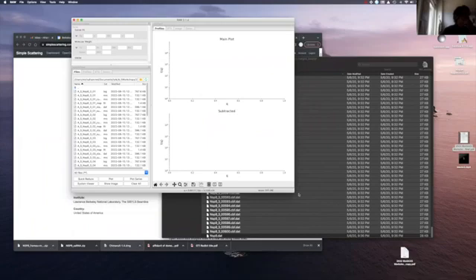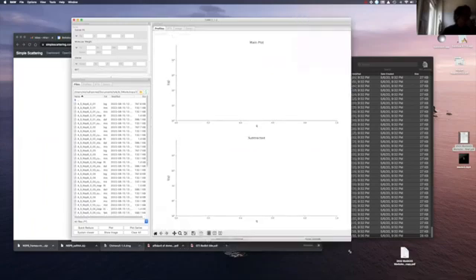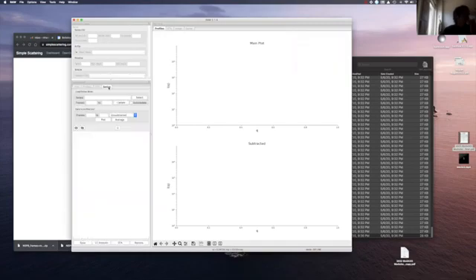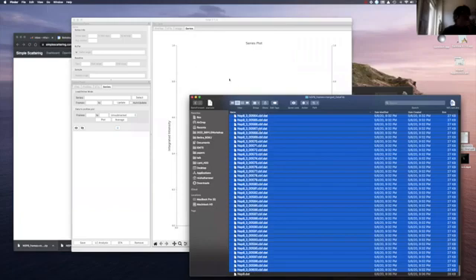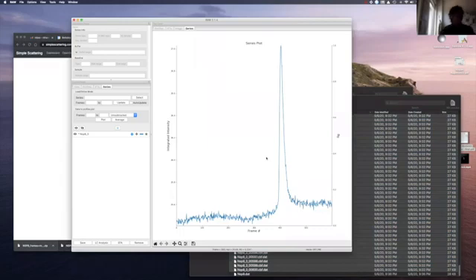And so here we have our RAW. You can upload the data here. I'm a lazy guy, so I just click here on the series, and RAW allows you to just grab the data set and put it in the series panel. And it will give you automatically this kind of SEC-SAXS profile.